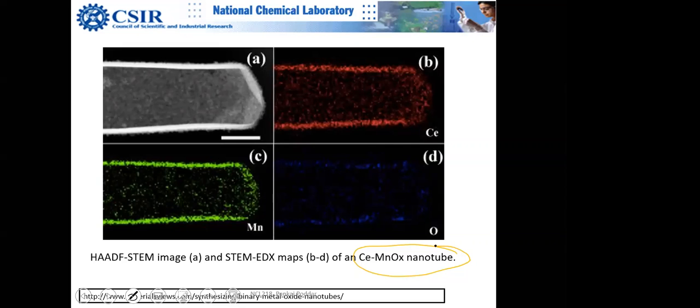Whether cerium is there? Suppose you do ICP. The problem is that even if the cerium particle is there somewhere outside, precipitated separately, it will give you only the overall result. Similarly, suppose manganese has interacted with something else, then it will give you averaged out information.